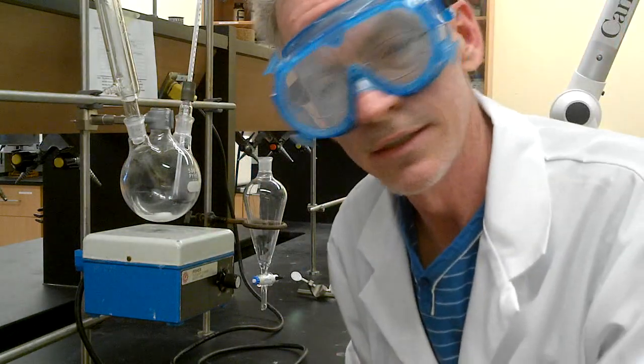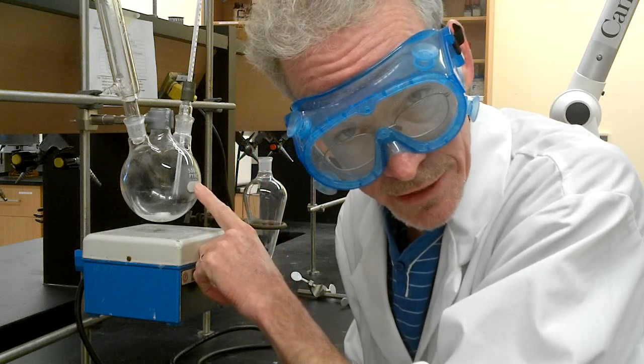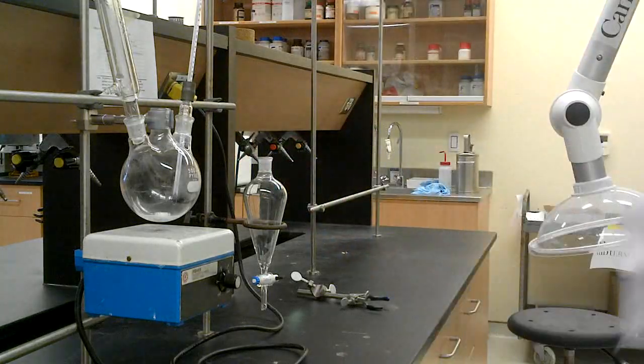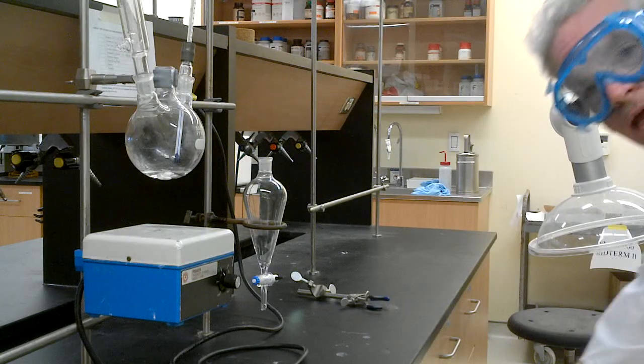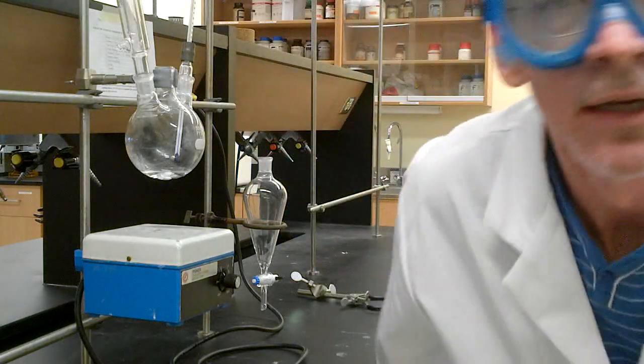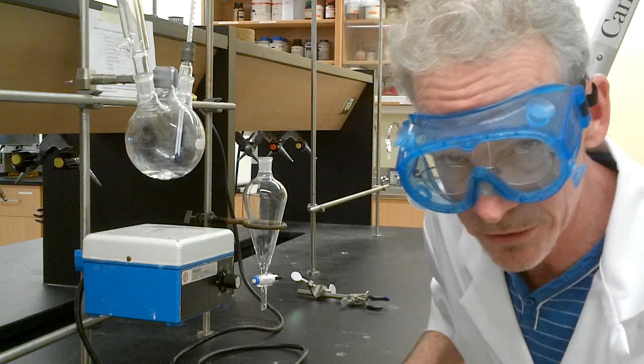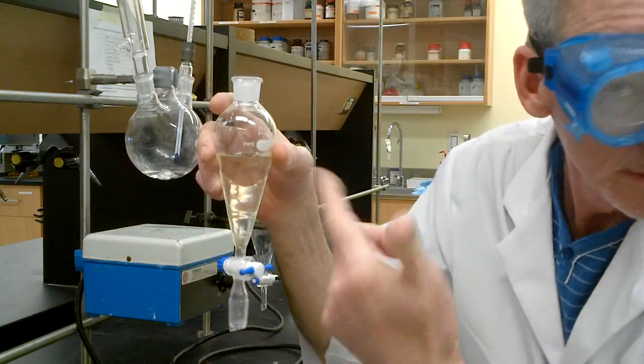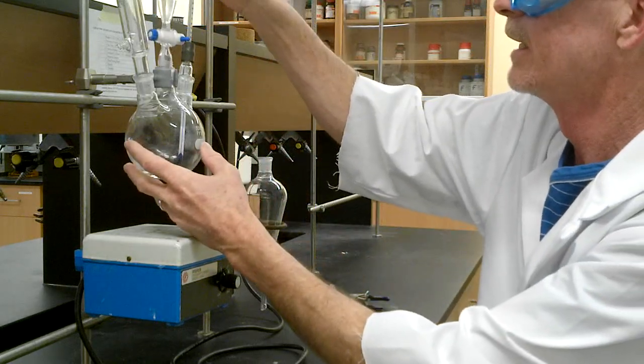Now, we're going to need the octanol and the glacial acetic acid and a sep funnel with some bleach in it. So I'll go get those. I've added the alcohol, the octanol and the glacial acetic acid. And in the fume hood, I've dispensed about 60 milliliters of bleach, sodium hypochlorite.